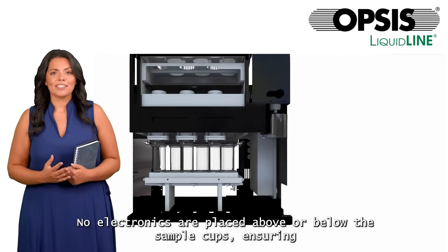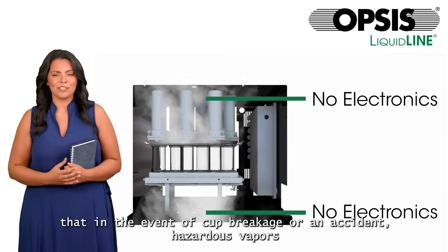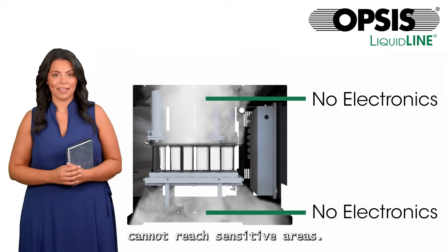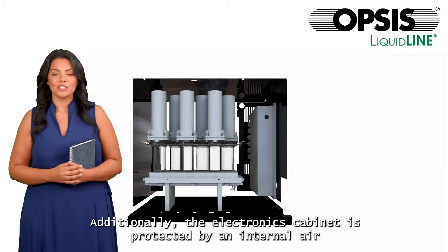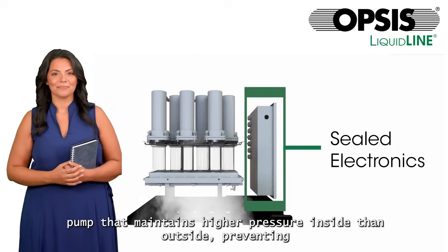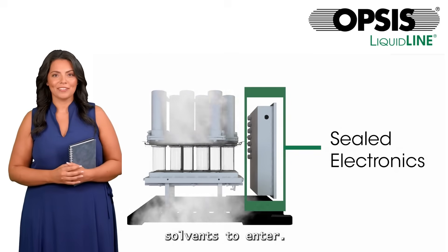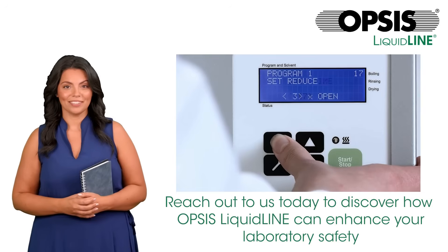No electronics are placed above or below the sample cups, ensuring that in the event of cup breakage or an accident, hazardous vapors cannot reach sensitive areas. Additionally, the electronics cabinet is protected by an internal air pump that maintains higher pressure inside than outside, preventing solvents from entering.